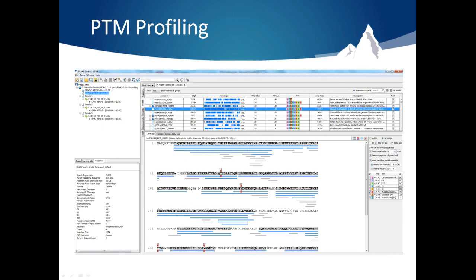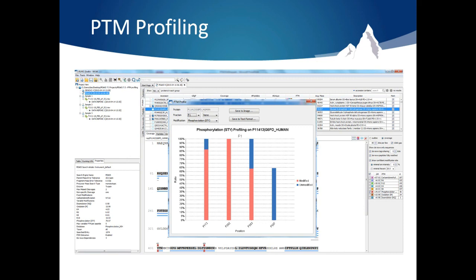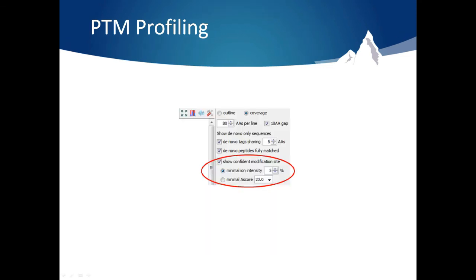Running PTM profiling is easy. At the top right-hand corner of the coverage view, select the PTM profiling button. This will compile the data and present the PTM profiling results for all the identified modifications in that protein. Only confident PTMs are used, so be sure to select either A-score or minimal ion intensity and the desired cutoff using the legend to the right of the coverage view.